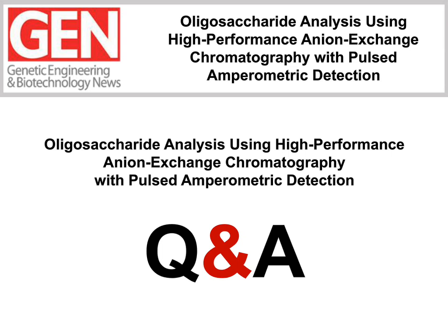Again, that's probably another yes and no answer. We say yes because with the hydroxide present, then we are able to detect the oligosaccharide. Remember that our electrochemical detection has to be at high pH. That said, we can separate those oligosaccharides just with sodium acetate. Now, to detect them, then we would have to add some hydroxide after the column, so post-column before the detector.